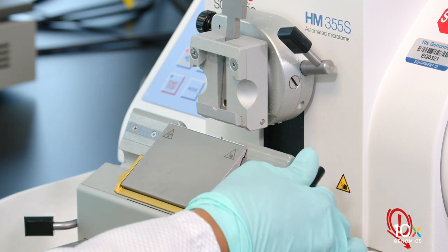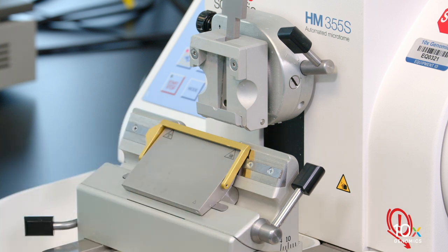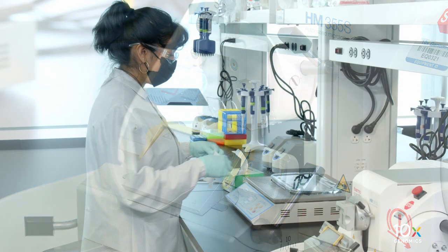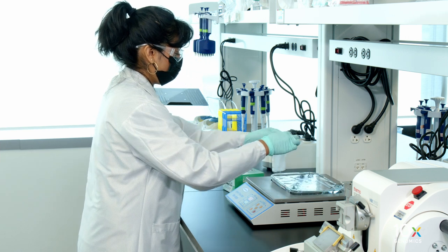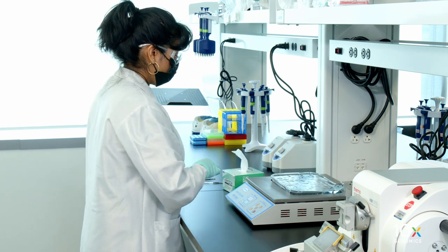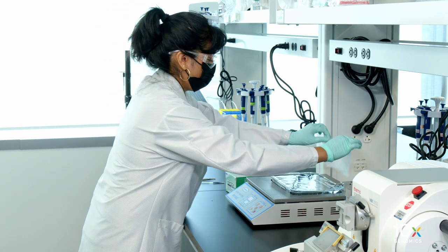Place the knife guard over the blade to minimize the likelihood of injury. Ensure that the clearance angle is set to 10 degrees. Ensure that the water bath is set at 42 degrees Celsius and is free from bubbles and particulates by gliding a KimWipe over the water surface. Repeat this step between sectioning as necessary.